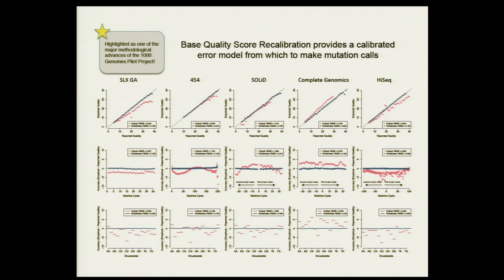There is just another thing that I remember from one of the retreat talks that we had. They said that for some of the samples, the library can affect the sample in such a way that a mutation happens after the library was prepared. So actually the sequence was correct, it's the library itself that changed. It's just something to take into account. Yeah, but even then, those things would show up as errors, right? And you would want to discount them.